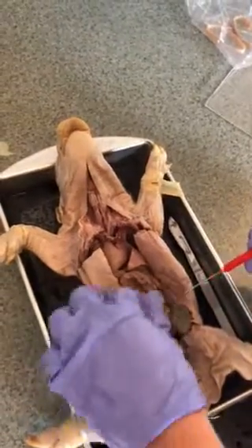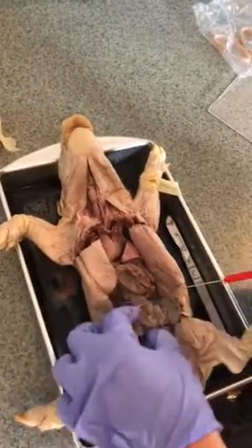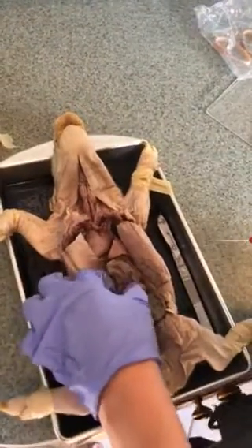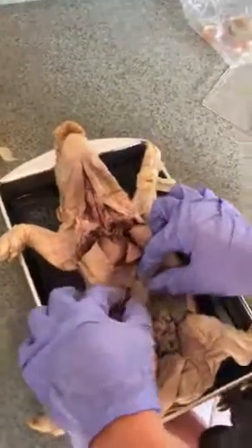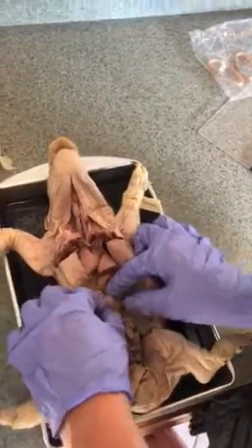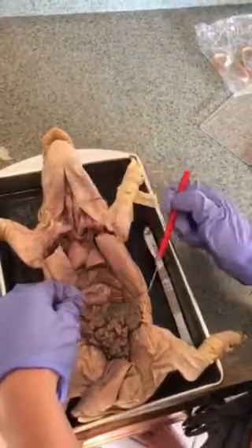Okay, this is a small intestine. All this area here that connects to the stomach. And we have the stomach, which is this whole organ right here. Connected right next to the stomach is going to be the spleen. So this right here is the spleen.